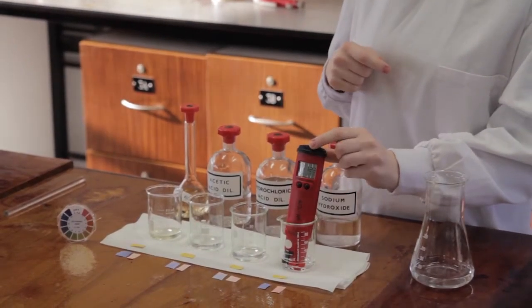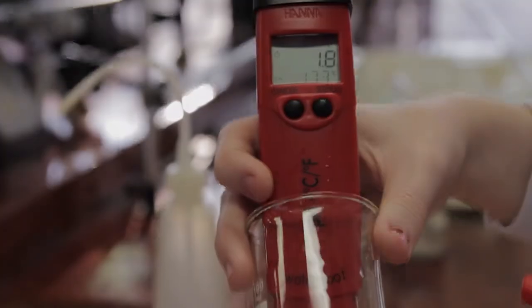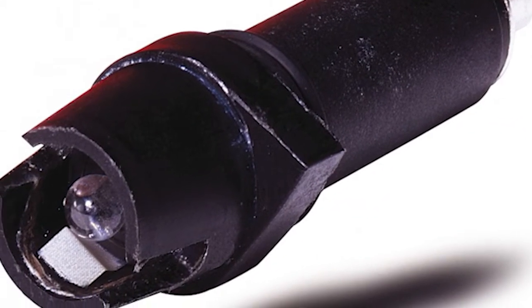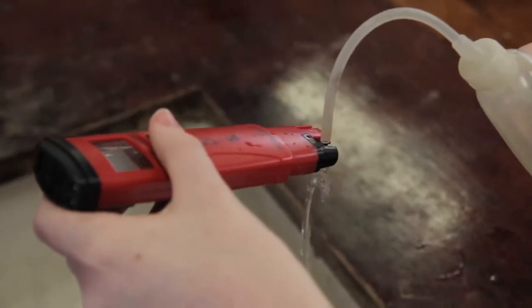There are different methods of determining a solution's pH. The electronic meter shown here is the one you will use in the lab. The glass electrode at the end is very fragile and must be fully immersed in the solution to give an accurate reading. After each use, please wash the electrode with distilled water and make sure the lid contains distilled water, as this prevents the electrode from drying out.